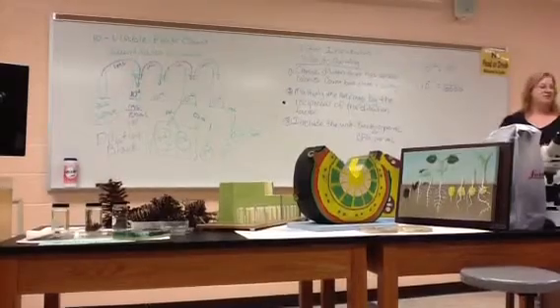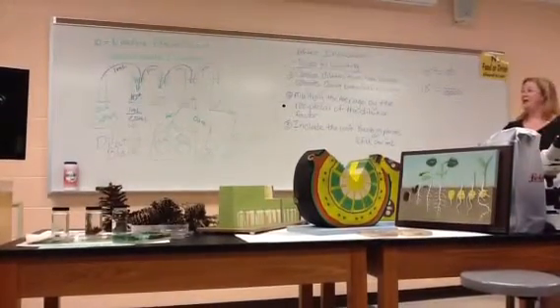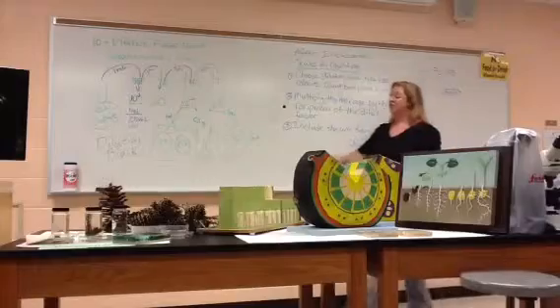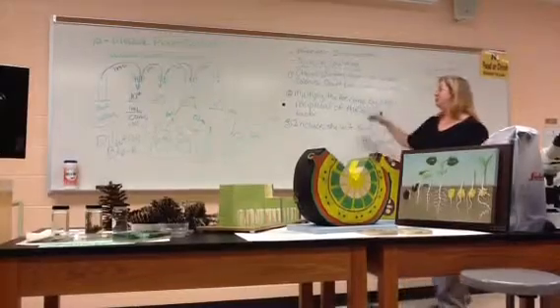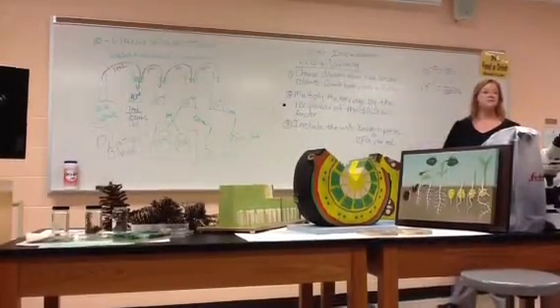Is there actually that you don't have to do this? You don't have to count, but that's what you would do. You literally count every single colony on both plates. So you made 2 duplicates, you've got to count each bacteria on each plate, and then average them together. Add those 2 numbers and divide by 2, right, to get an average from both plates.